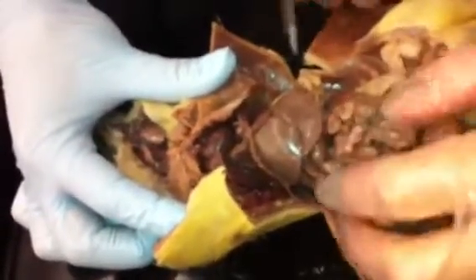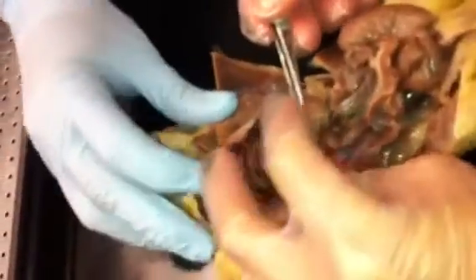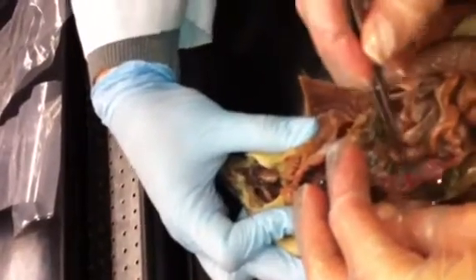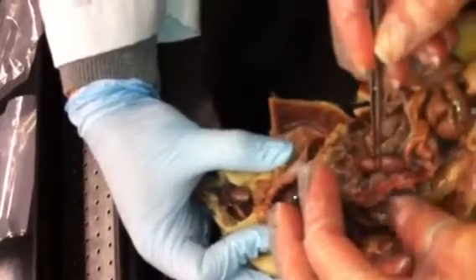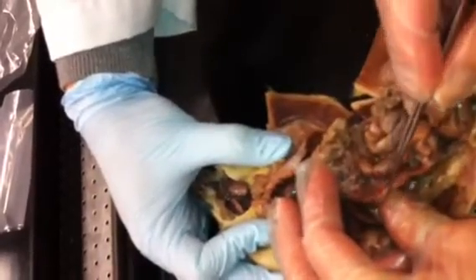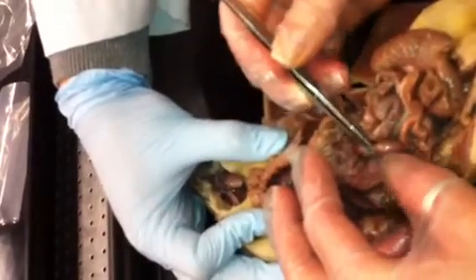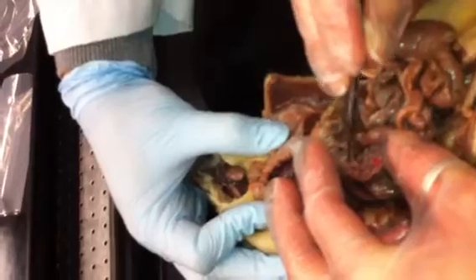Now the pancreas can be a little difficult to identify, so I'm going to lift up the liver, and I'm also going to try to lift up the stomach. Now in some rats it's pretty obvious, but I don't know if you can tell. This is part of the small intestine, so I'm going to try to pull the large intestine over, and the pancreas is this delicate kind of mushy material right here.